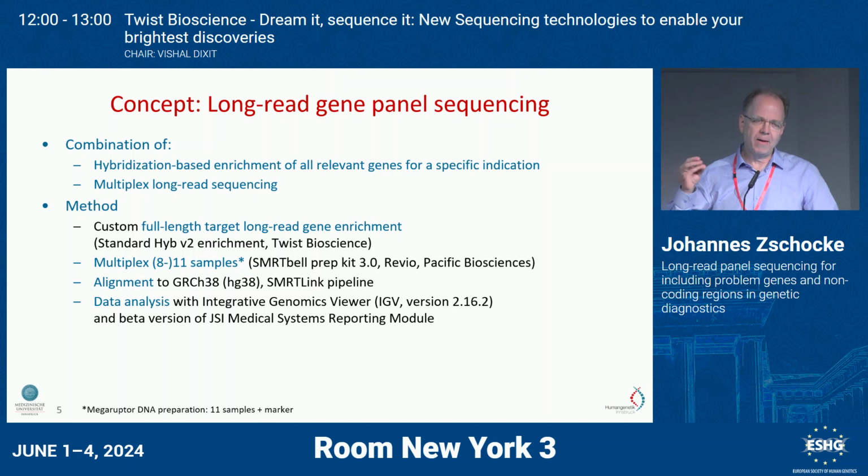So that's why I thought about a concept of doing long-read sequencing on a panel basis, and that's the reason why I'm here. It's a combination of the well-known hybridization-based enrichment from exome analysis of all relevant genes for a specific indication. For many of the indications that we have in daily practice, like kidney disease, heart disease, eye disease, we have a well-established set of genes that we are interested in.